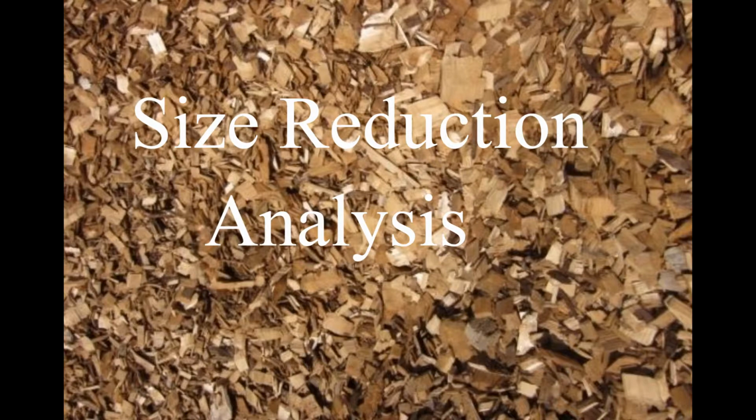Particle size reduction is used to pellet biomass for solid fuel, improve ease in transportation, or increase the specific surface area to improve reactivity. Typically, size reduction is a mechanical process and consists of cutting, chopping, or grinding, usually with machines with working parts and required energy input. Therefore, the measurement of size-reduced biomass is critical.